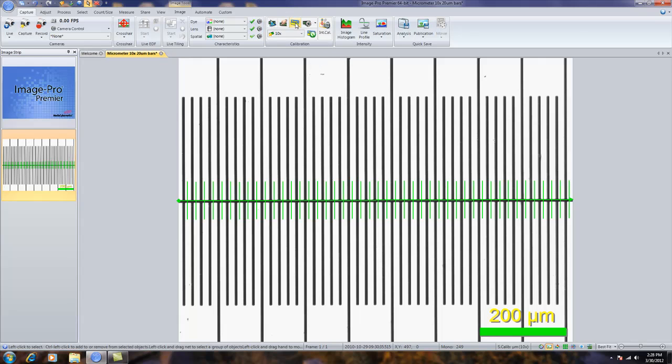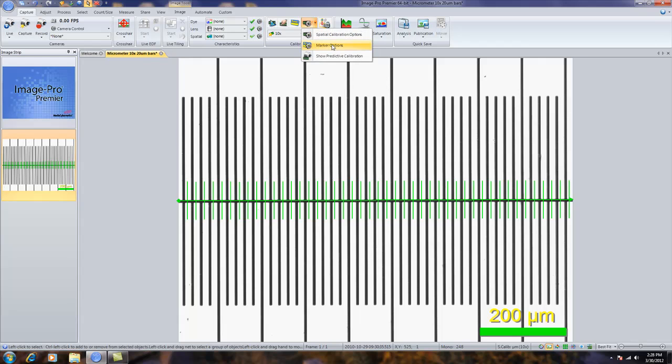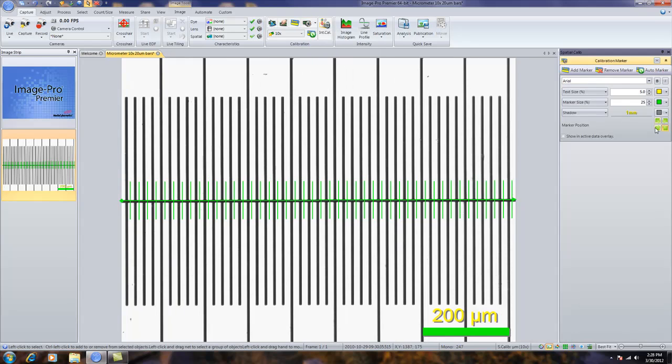To turn the marker bar on and off, you can simply toggle it on and off. You also have control of the marker bar by using the marker options. Here, where this little gear image is, I can select marker options.